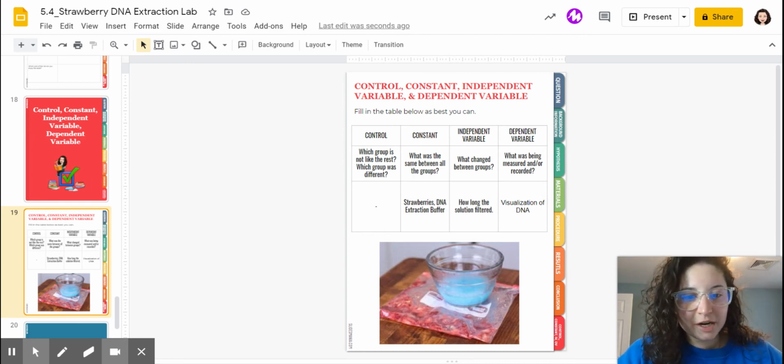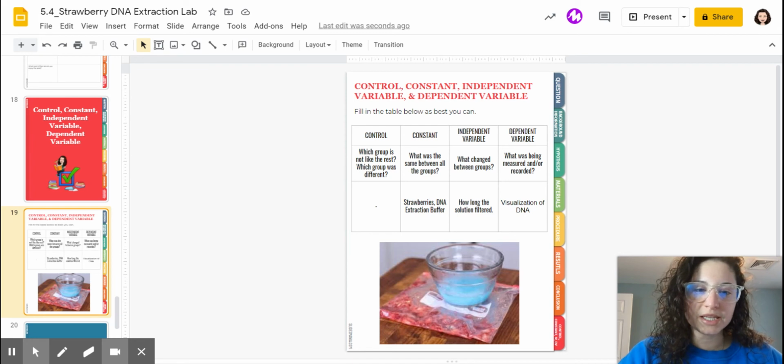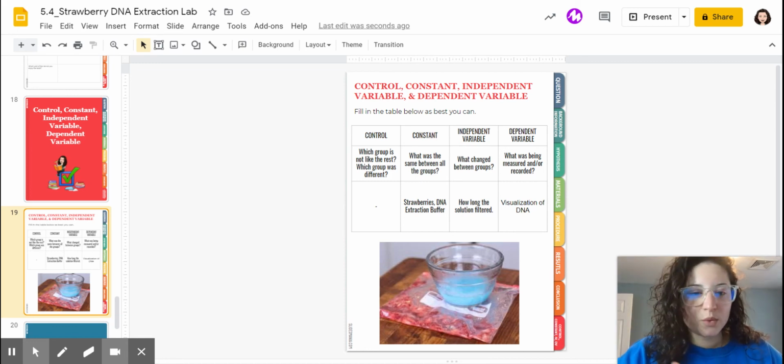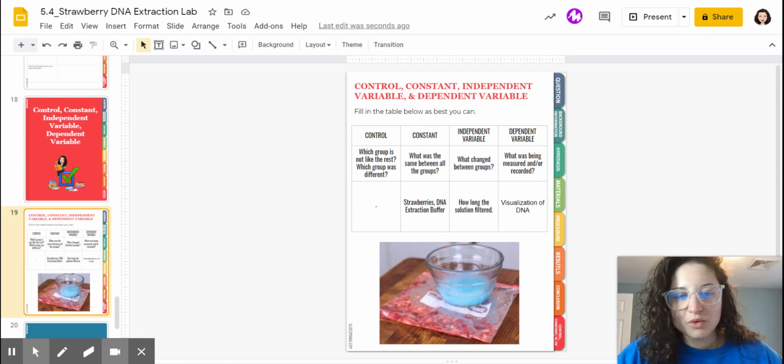The independent variable could be how long the solution filtered for, because this could affect how much DNA you were able to gather. And then the dependent variable, the thing that we are measuring or recording, or the product we are looking for, is the actual visualization of the DNA. So actually getting that gunk on the popsicle stick, collecting your DNA would be your dependent variable or your result. It's what we were expecting to have happen.